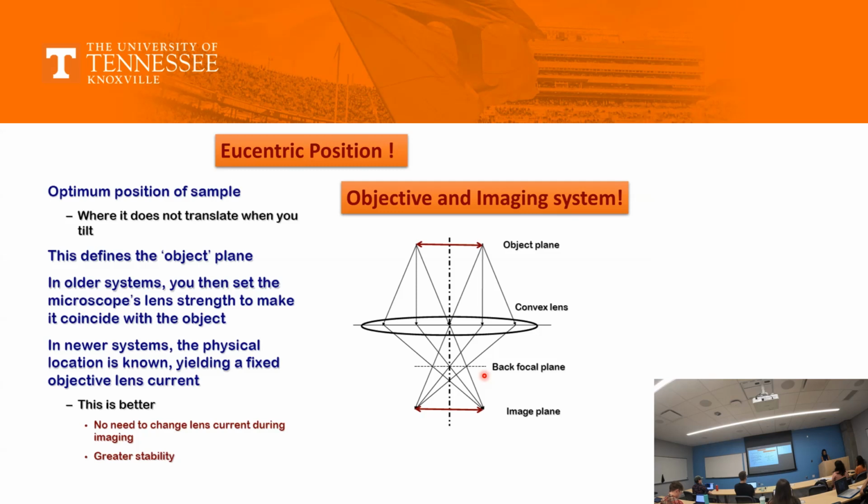And at each step, at least in the first few, you start playing with the D. But every time you change the current, your back focal plane would change, and so does the position of your object. So when you sit at the microscope, you have your object inserted and then set a line. Now you are seeing an image. Light is falling. You see an image that is totally blurred, or has a lot of astigmatism. Your objects are not sharp, all the small things that you're seeing. The number one reason is that.